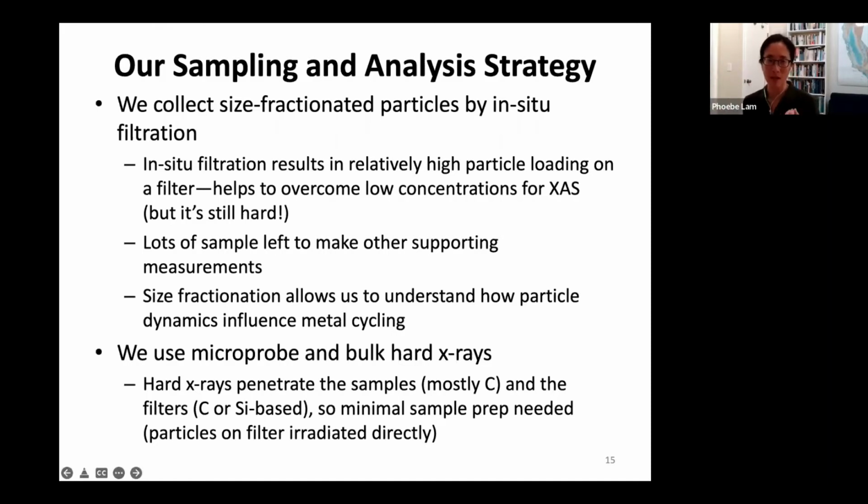Right now I'm starting to get into soft X-rays, but most of my career, I've been focused on hard X-rays. And the great thing about hard X-rays is, of course, they penetrate. The samples are mostly carbon, so it's a light element, and the filters are carbon or silica based, so also light elements. So hard X-rays penetrate this, and minimum sample prep is needed. For the hard X-ray work, I just put the particles on the filter and then irradiate them directly. And I don't do any further prep, which is nice.